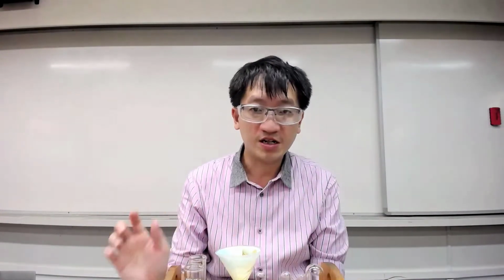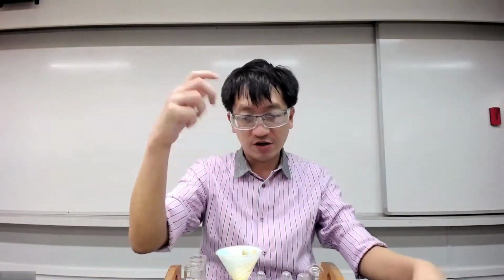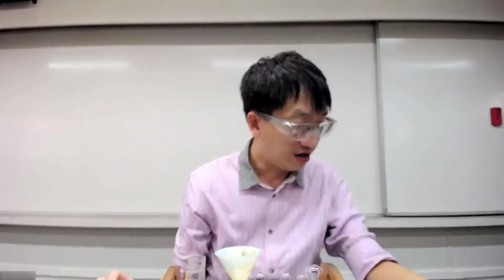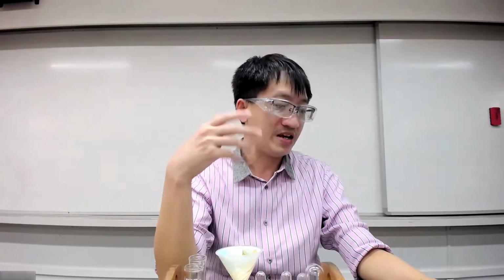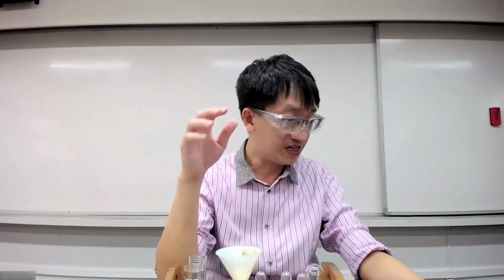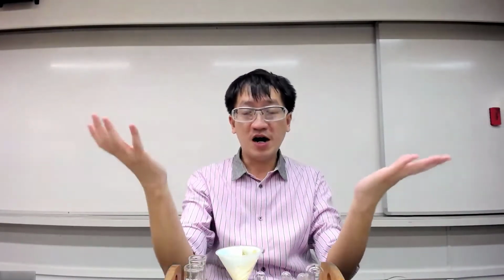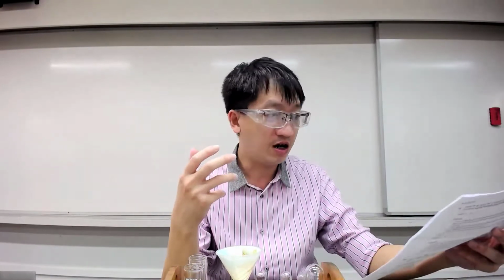You don't need to wait for the filtration to complete, because if you read the instruction later on, they mention that you're supposed to wait for the residue to completely dissolve, and then retain the solution for C part 2 and C part 3. So during the exam, a good way of working through the problem is to take a look at C part 2 and C part 3. From there, you will have a sense of the amounts which you need.